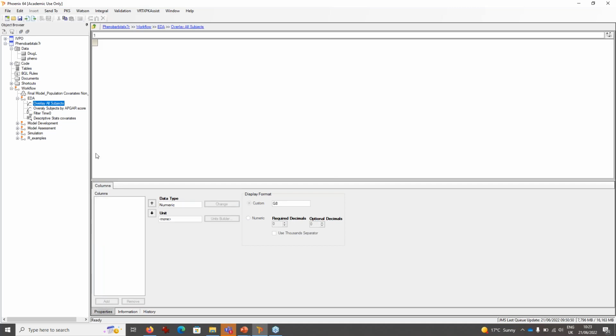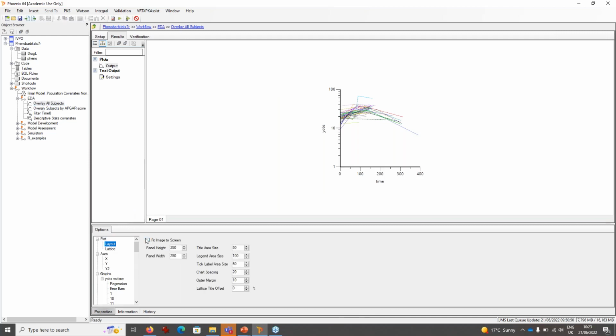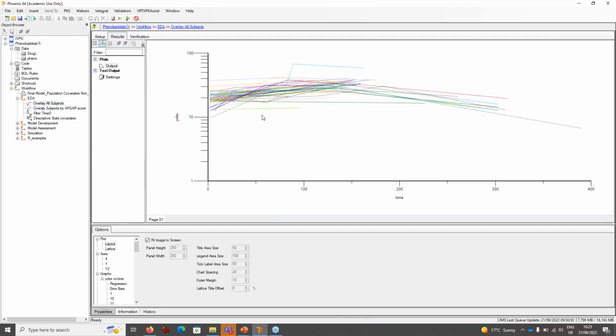First of all, review your data. What does it look like? Well, in this case, it looks pretty sparse, and I don't know how I'm going to model that data, certainly as an individual. But we can apply the population tech to build a effective and representative model of that data, as I'll show in a moment. But certainly NCA is out of the window with this.